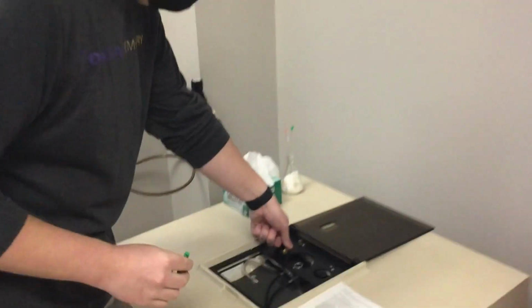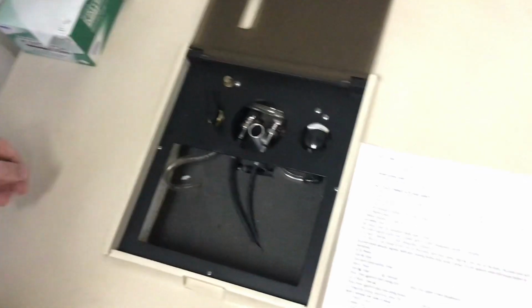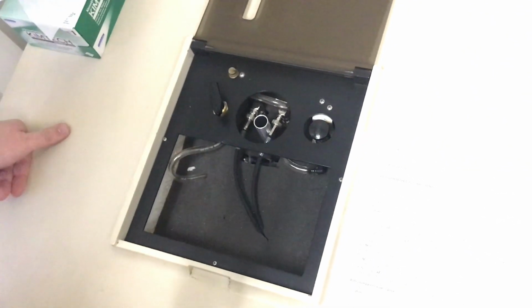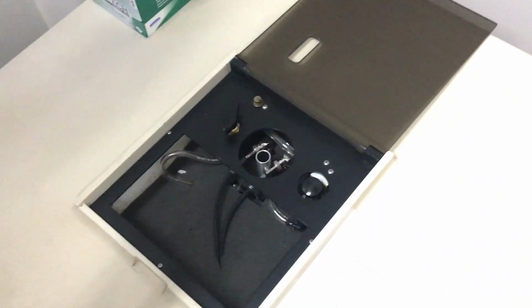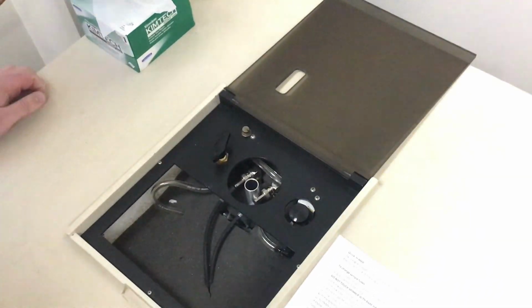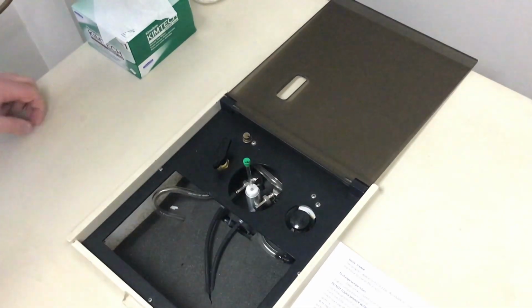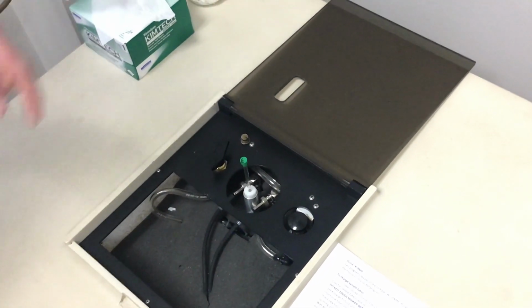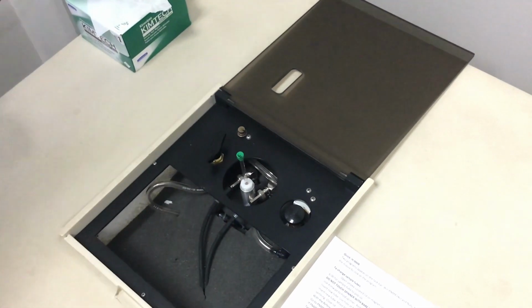So now, if you're worried that you will forget that there is supposed to be air running, just leave it on, because when you've done this a couple of times, it won't take you very long to switch out samples. But with the air back on, I'll take this back down, set it right there under the current, and it will float again. Now, you will most likely mark the top of your tube with something to let you know what's in the tube. In this case, it's marked with E, for ethylbenzene.